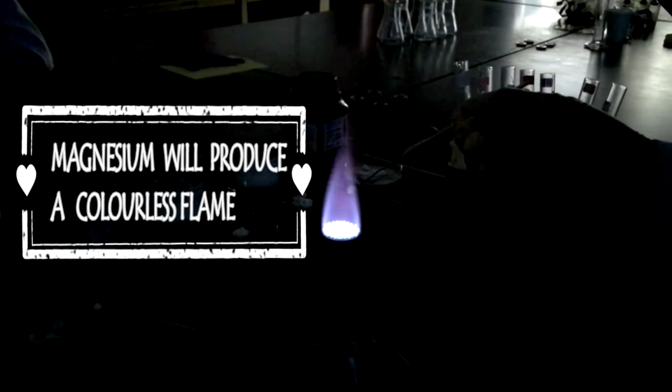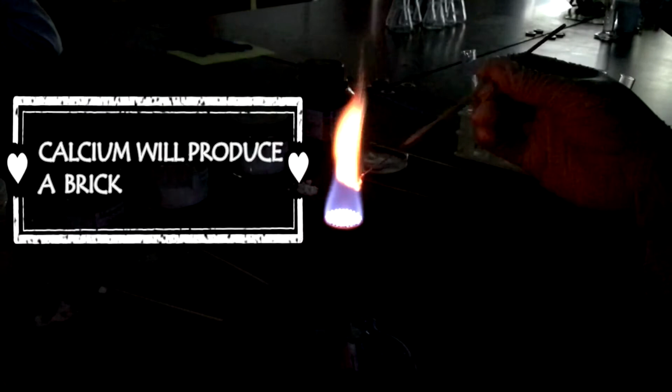Magnesium will produce a colorless flame. Calcium will produce a brick red flame. Strontium will produce a crimson red flame. Barium will produce a pale green flame.